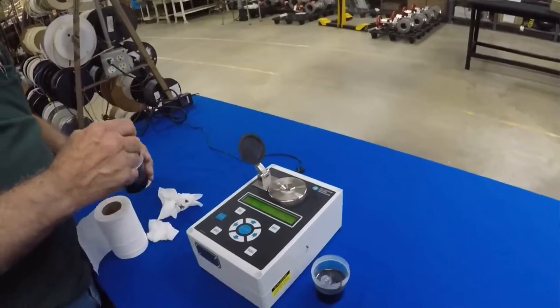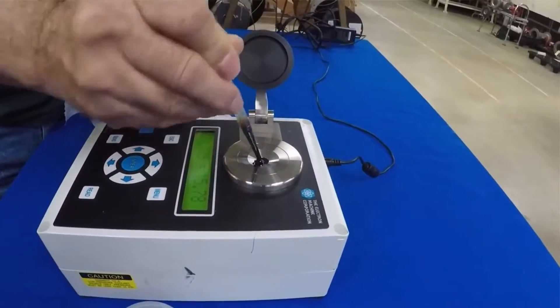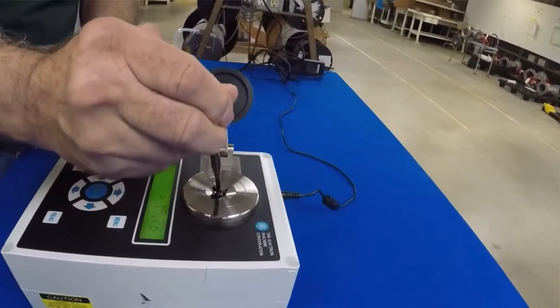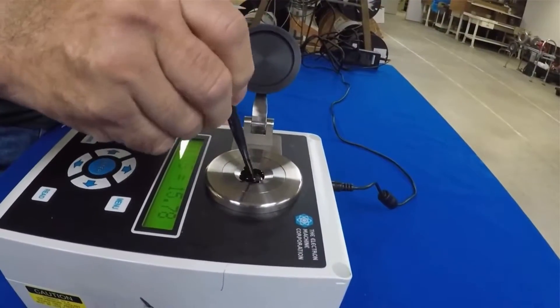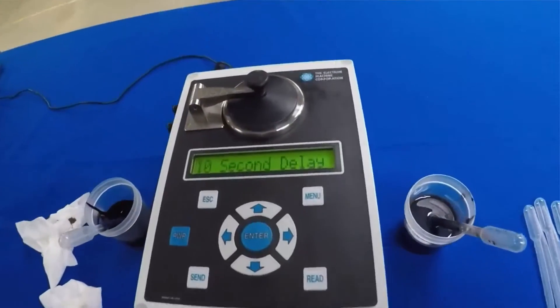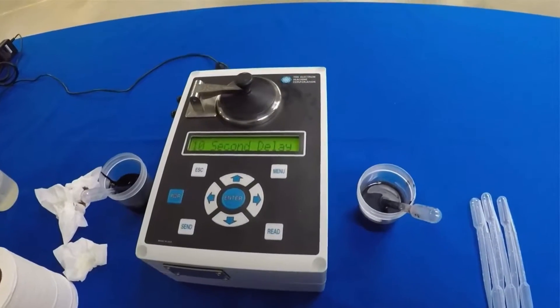Now we'll test the heavy liquor, basically following the same process. It doesn't take much — you just want enough to cover the lens. Give it a good little stir once you get it on there. This can be done with hot liquor. Hit the read again and you wait your 10 seconds.